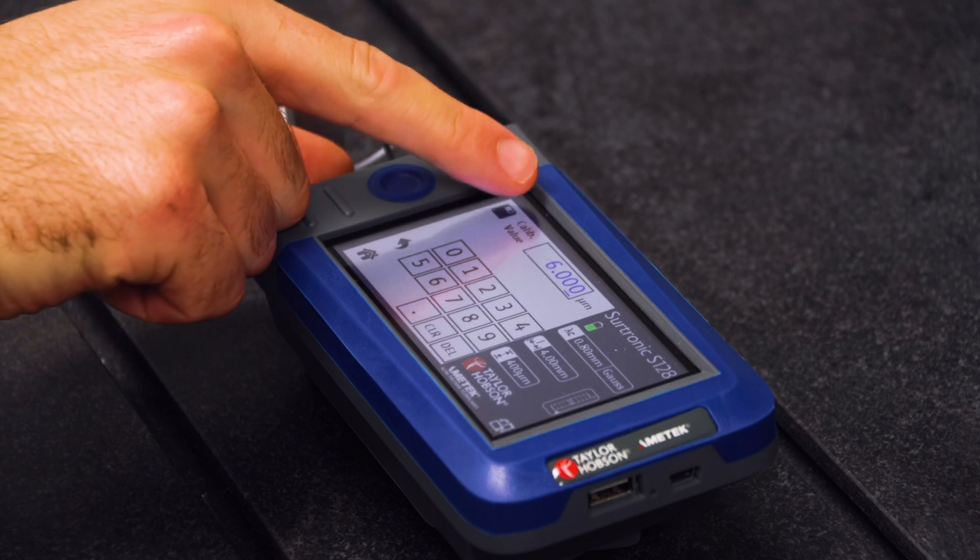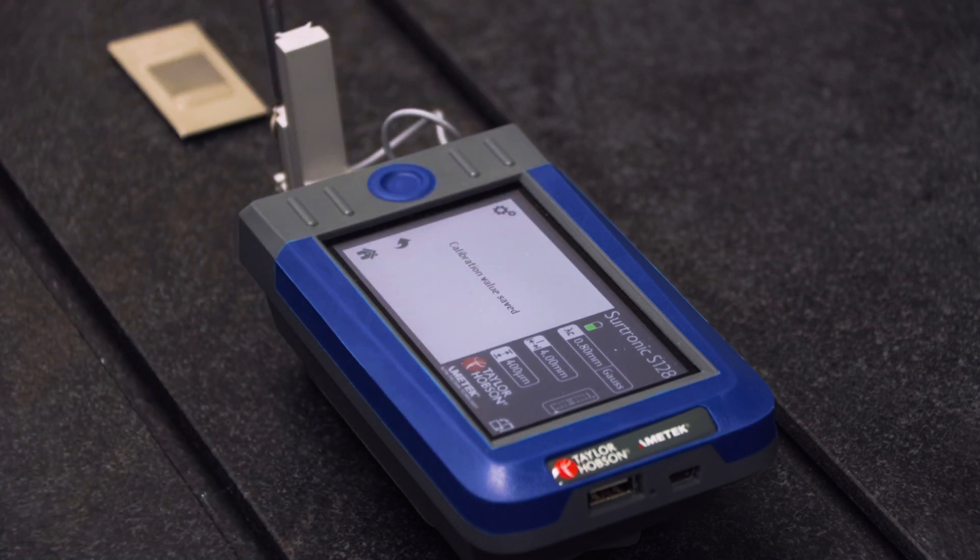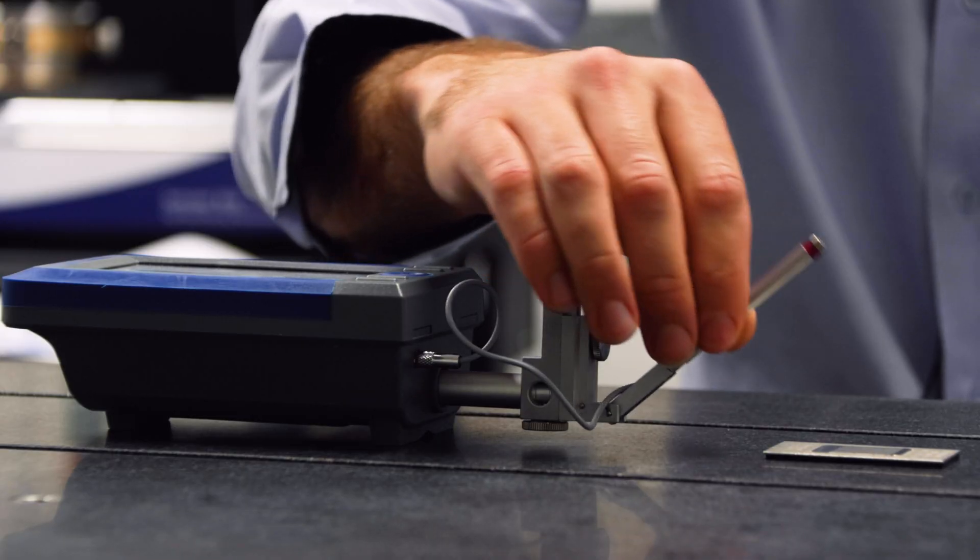Click on the save icon. The calibration value is now saved.